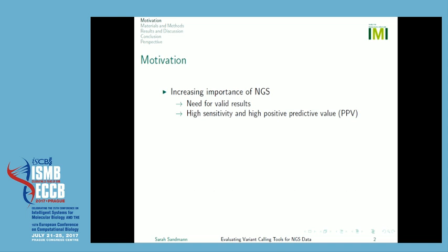As you all know, there is an increasing importance of NGS, and this is true not only in research, but also in clinical use cases, so personalized medicine. And what you do, of course, need are valid results. So you have a real need for high sensitivity and high positive predictive value in results.